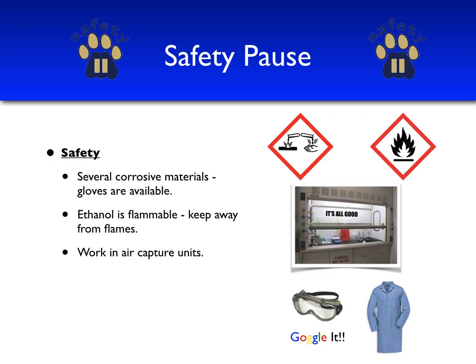For today's safety pause, we note that there are several corrosive materials. Generally, many of the strong acids, strong bases, and copper sulfate solids are corrosive. We'll be using gloves for most of this experiment. We also note that ethanol is flammable and we want to keep it away from open flame.